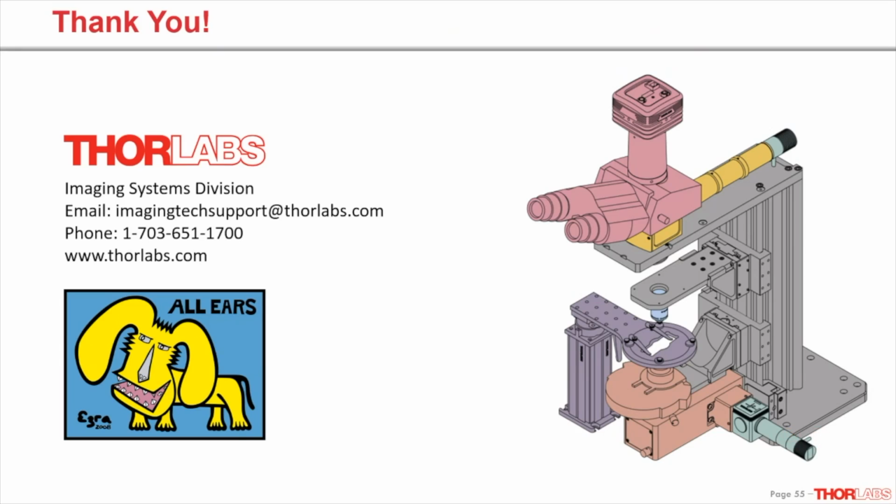Thank you, Melissa. I'm bringing back Henry as well. Thank you for the talk. I'm going to ask some questions that some people have posted. First question is, what is the best way to illuminate through a fiber? Do you need Kohler illumination when you don't have a filament? Is a collimating lens enough?